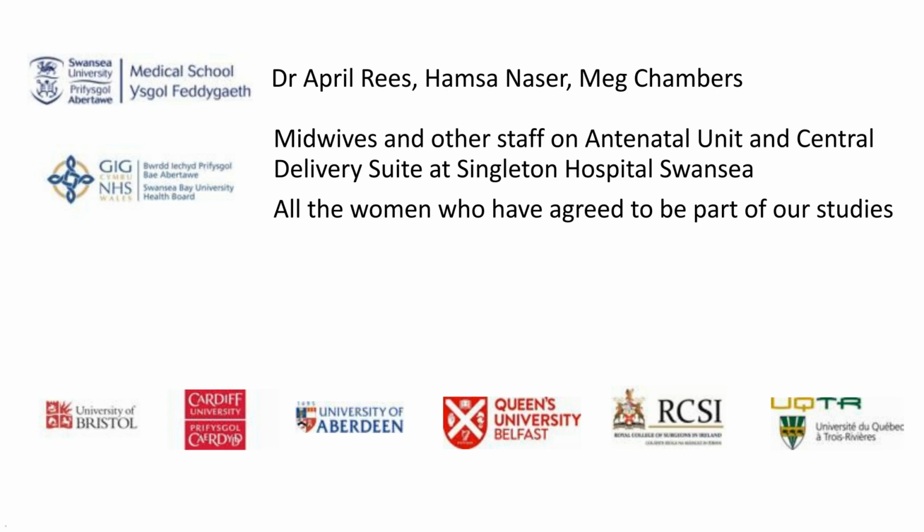So then the Seahorse does need quite a few cells. You need about 200,000 cells per well, and you need to do multiple replicates. And so you do need a good few million cells to do that analysis. But the NanoString, I really like it because you only need that 60 to 80,000 cells to really get a good comparison. You can do those 800 odd genes on that. And our mass spectrometry approaches, we've whittled down to around about 100,000 cells as well. So we work really hard on reducing the cell numbers.